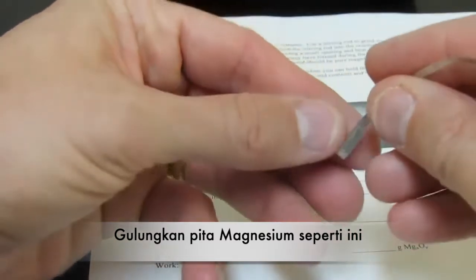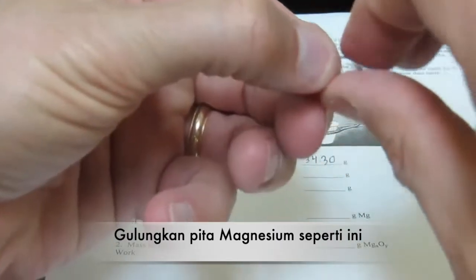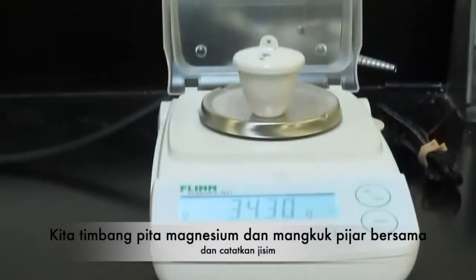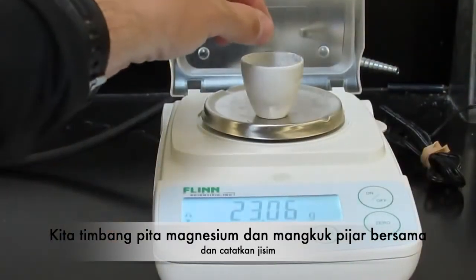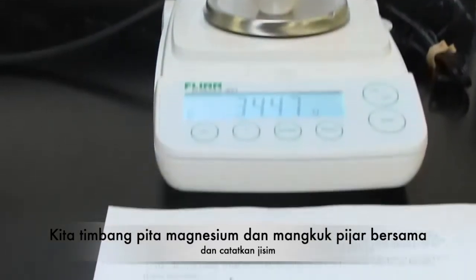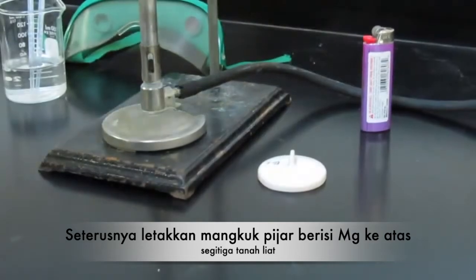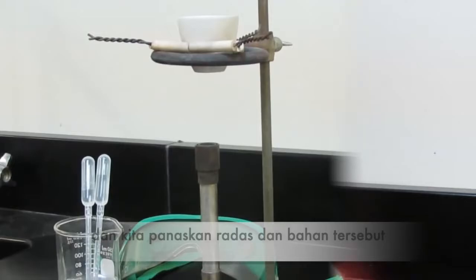And this is pretty easily done. And then we'll add that to our crucible, and then we'll get the mass of our crucible, cover, plus our magnesium. You can see me do this for what it's worth. So let's see what we end up there with: 34.47 grams. So we'll record that. Place the crucible on our clay triangle, and we'll then go ahead and light this.